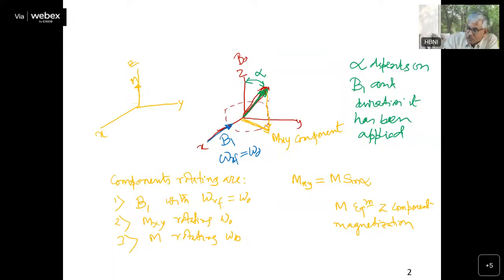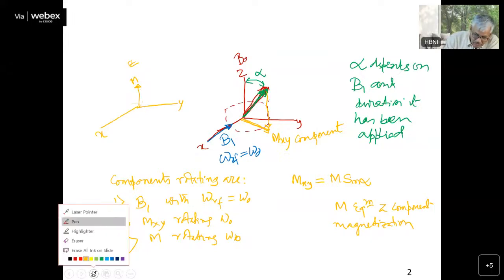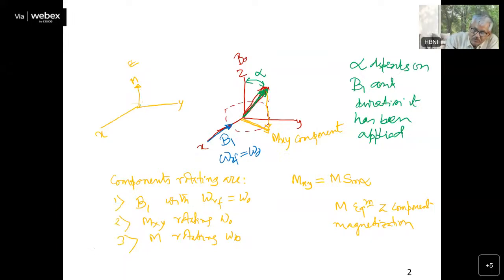But if you tilt it a little bit, which we are doing here, as you have tilted it, it has now moved to this position. So it will start precessing.